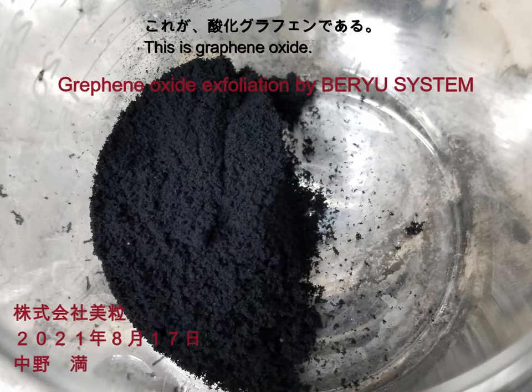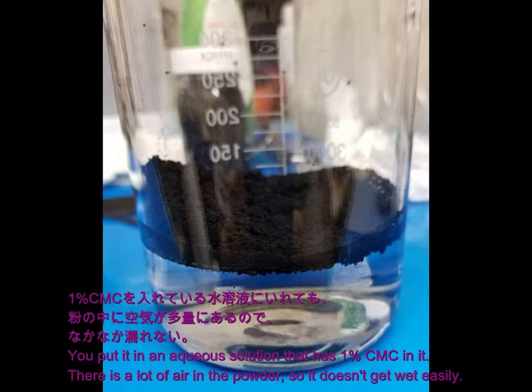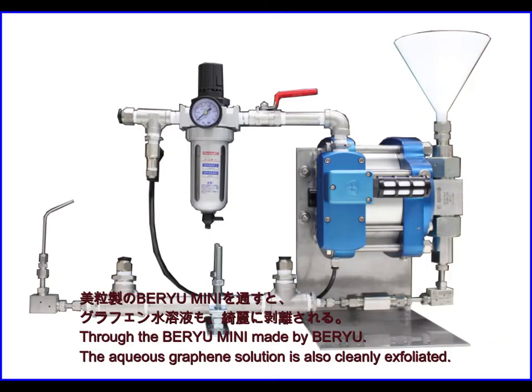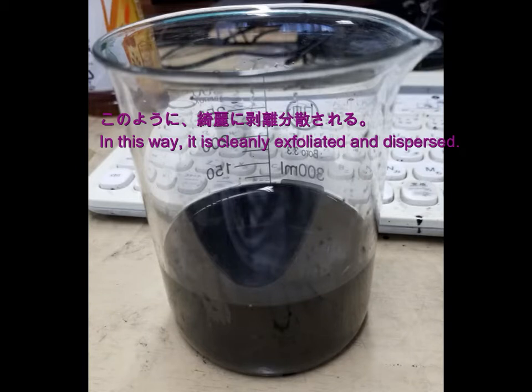This is graphene oxide. You put it in an aqueous solution that has 1% CMC in it. There is a lot of air in the powder, so it doesn't get wet easily. Through the BERYU MINI made by BERYU, the aqueous graphene solution is also cleanly exfoliated. In this way, it is cleanly exfoliated and dispersed.